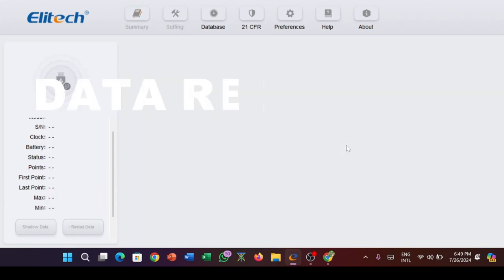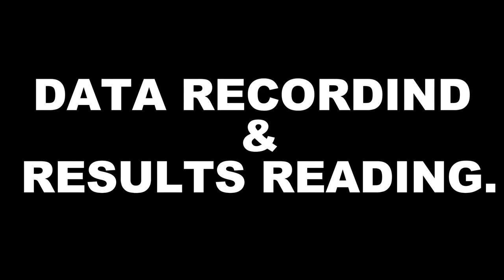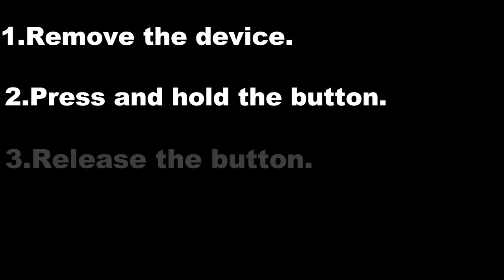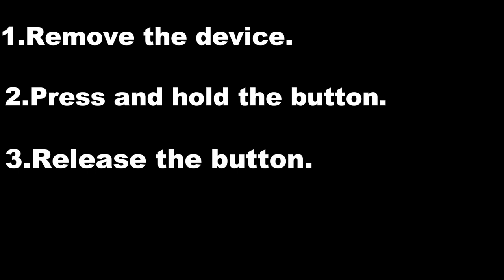For data recording and results reading, remove the device and press and hold the button until the display reads red. Release the button and allow the device to record in your preferred environment.